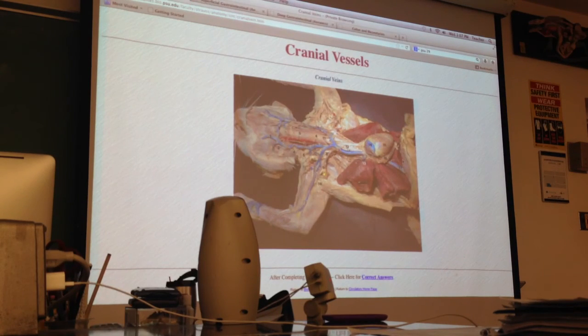Can you repeat what you said about the trachea again? Yes, so if we're trying to decipher the trachea from the tracheal cartilages, the brown is actually the cartilage, and the white is the membrane in between the cartilages. So if we pin the white, that's only going to be trachea.